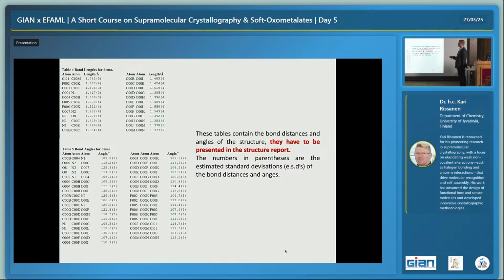Then there is the O-carbon, this is 1.4, this is an OH distance. Then we have again one of the same fluorine-carbon, 1.3. And you can see, even though it's the same bond, the carbon-fluorine bond, it's never exactly the same. You have probably been told in the course that in the benzene ring the carbon-carbon distance is 1.39 and the angle is 120. But this is the ideal value. The real values always have errors in them, never the same.